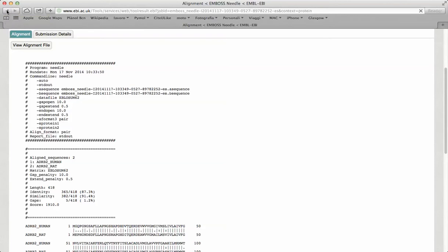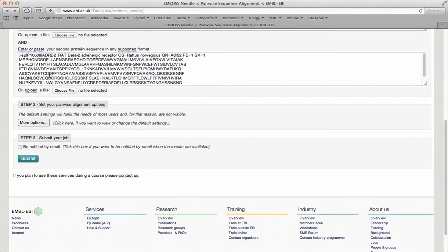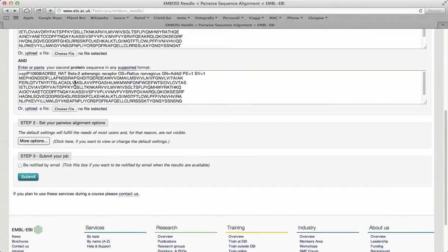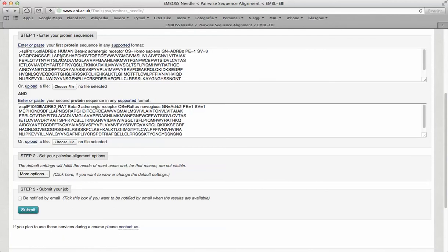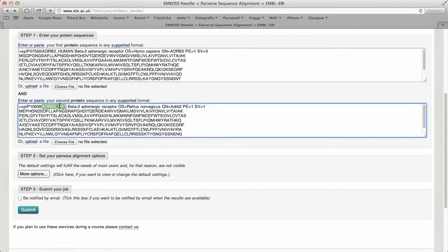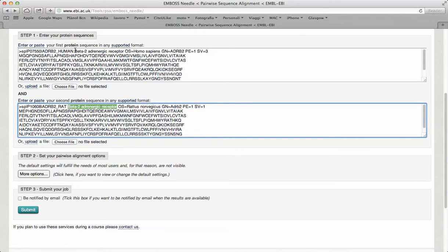Now, we are going to change one of these two sequences by other sequences more distantly related. In this case, the comparison that we conduct was between two homologues in different species, human and rat, of the beta 2 adrenergic receptor.